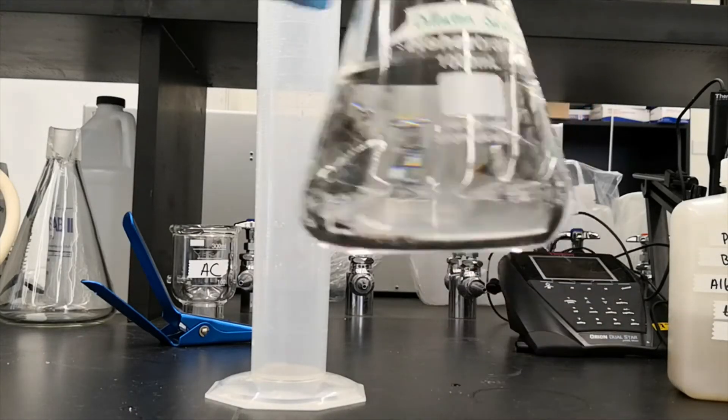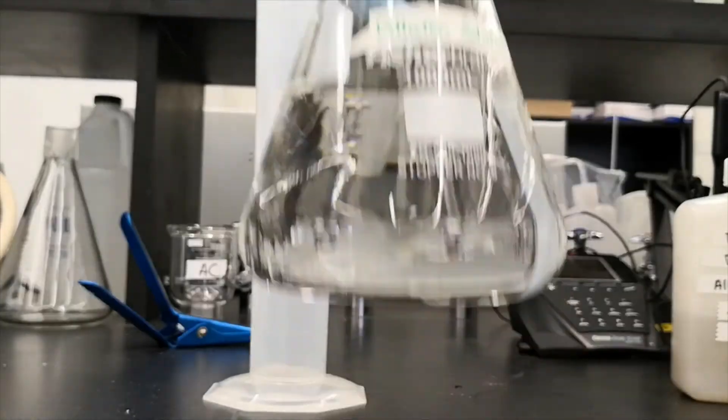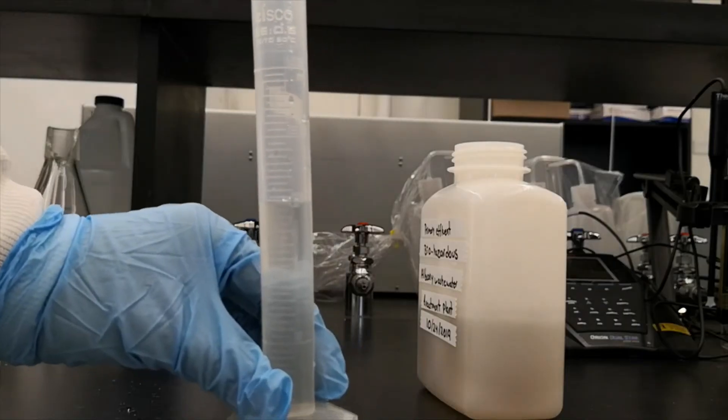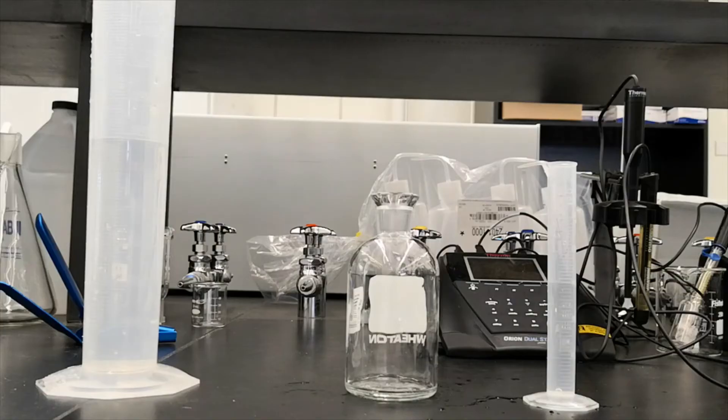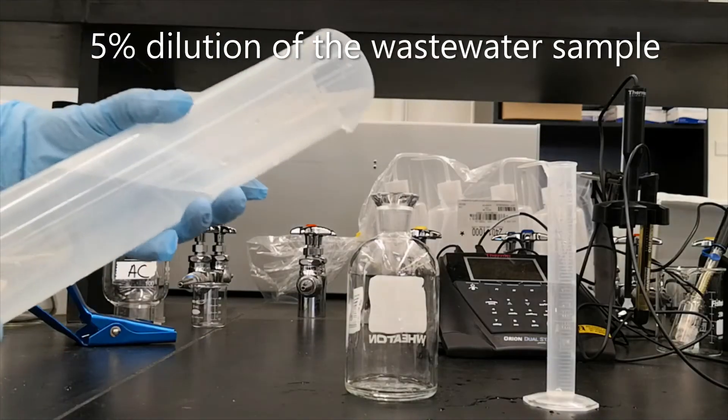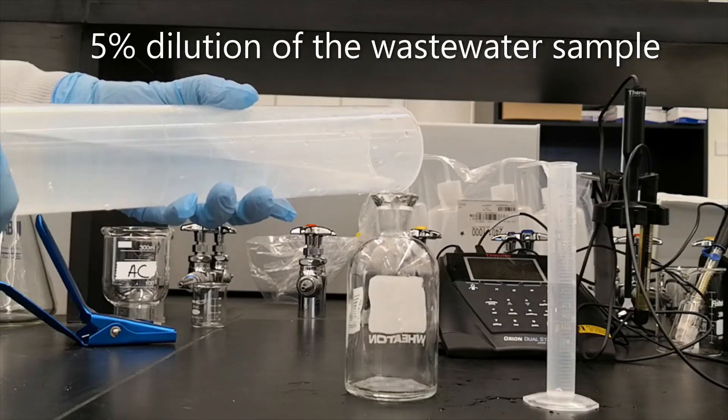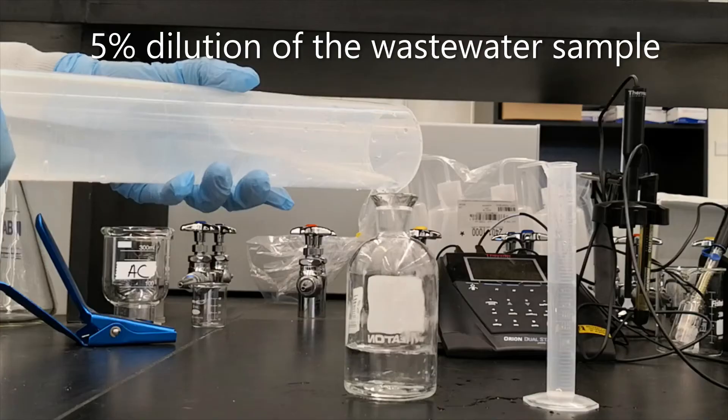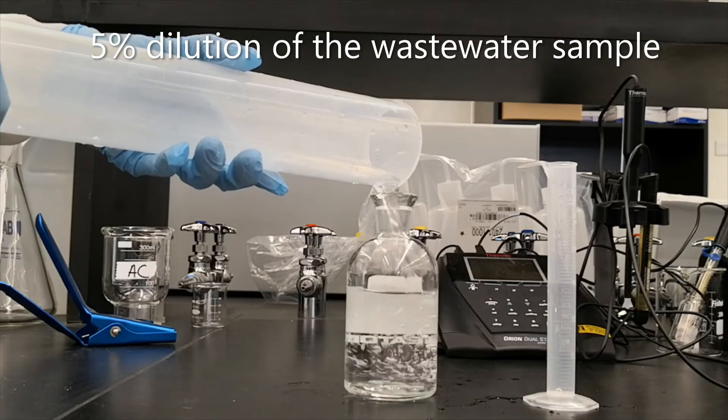And this is the dilution solution. And this is a wastewater sample we collected from wastewater treatment plant. And we are going to mix them in the BOD bottle. In this case, we added 5% of the wastewater sample into the bottle with the dilution solution.